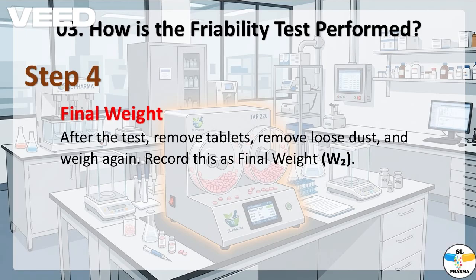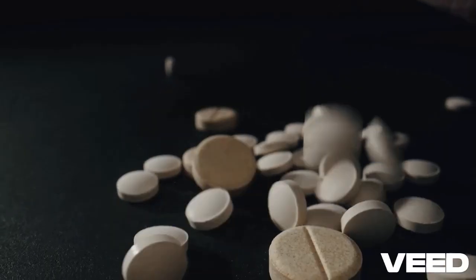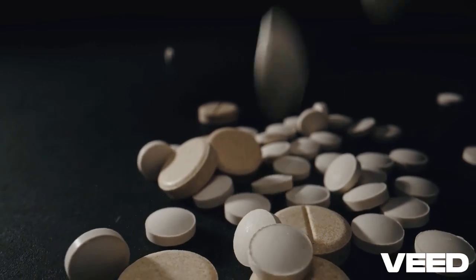Now we calculate the percentage friability using the formula. Friability percent equals (W1 minus W2) over W1 times 100. Here, W1 is the initial weight and W2 is the final weight after the test. If the result is less than or equal to 1%, the tablets pass the friability test.